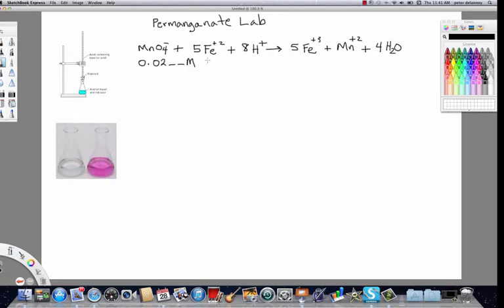In order to do that, we're going to start with a known concentration of the iron 2 cation, and where we're going to get the cation from is going to be a 0.5 gram sample, which is going to be massed out analytically so that we're going to know this value to 4 decimal places.